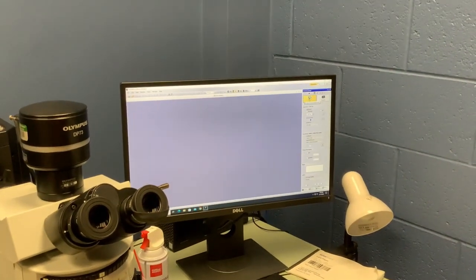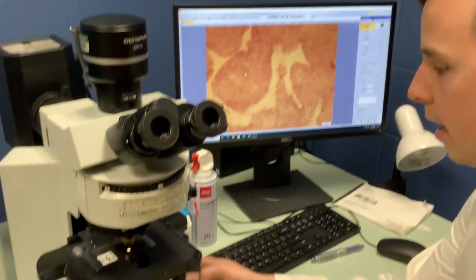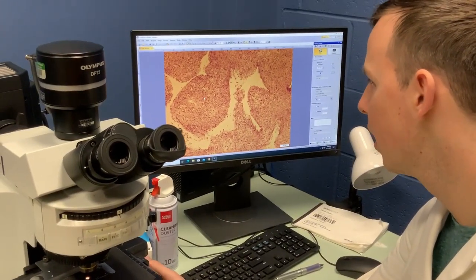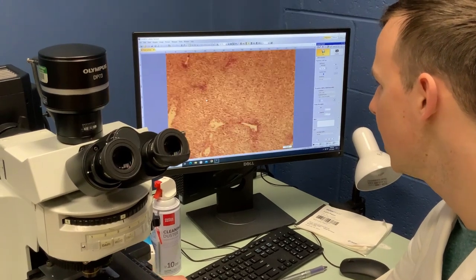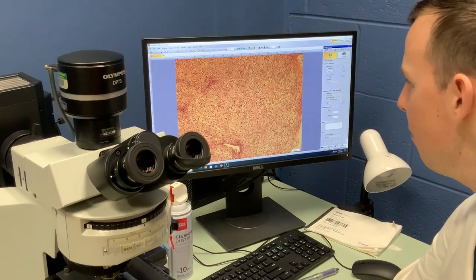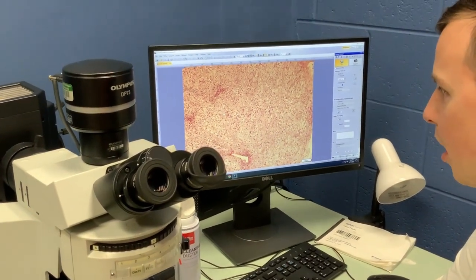We hit this live button here to switch on the display, and then we can use the focus knob to focus on our sample. This is an H&E stain that was prepared by Bardis in my lab. We can adjust the brightness to get the kind of picture we're looking for.